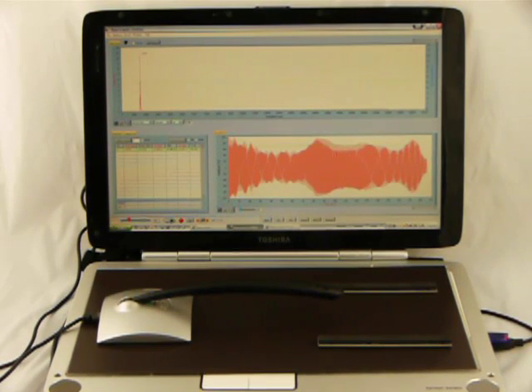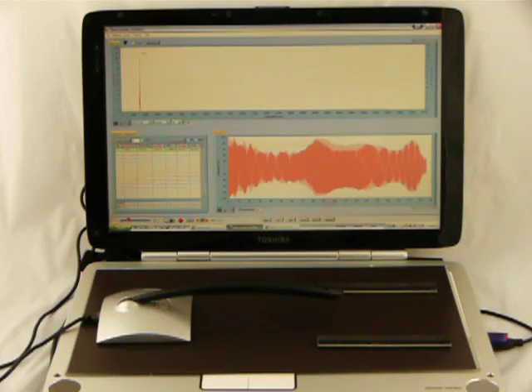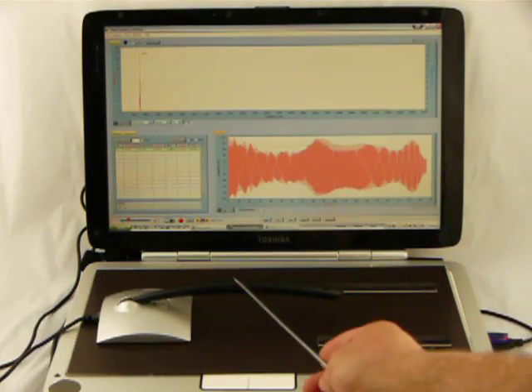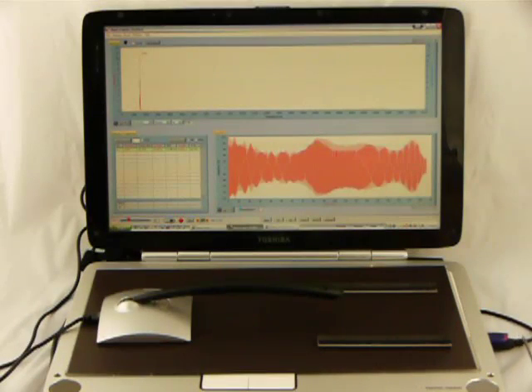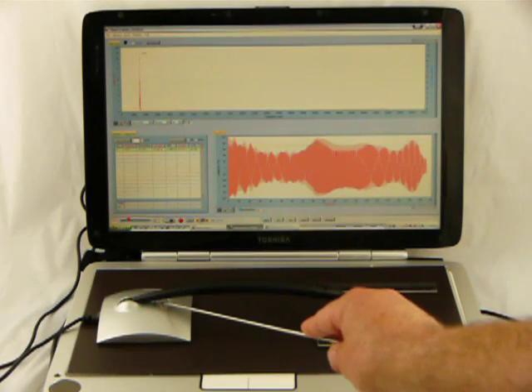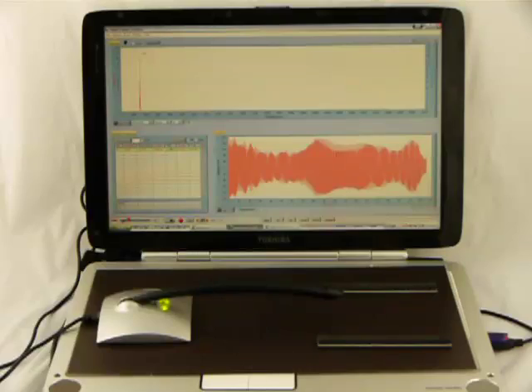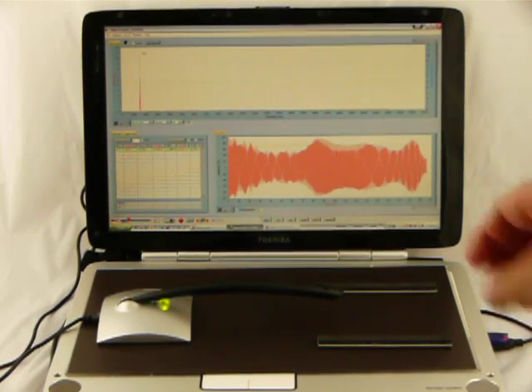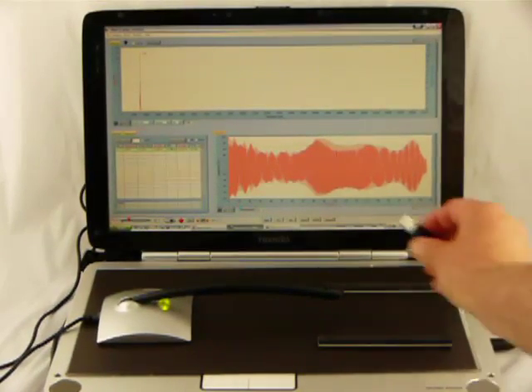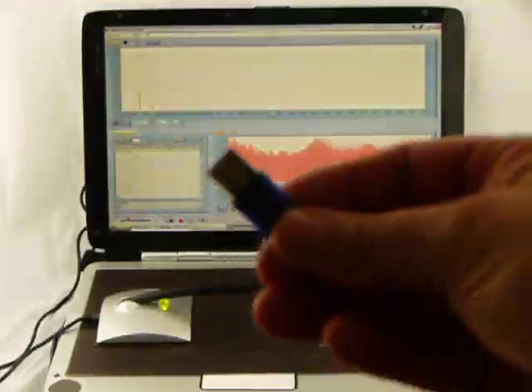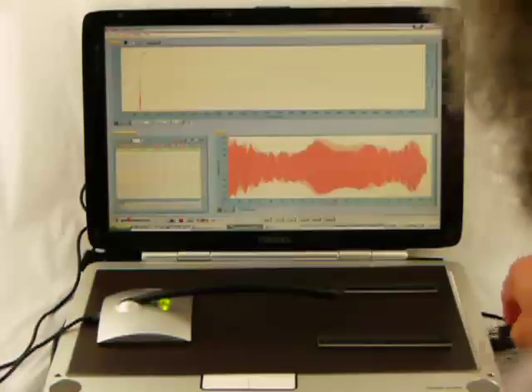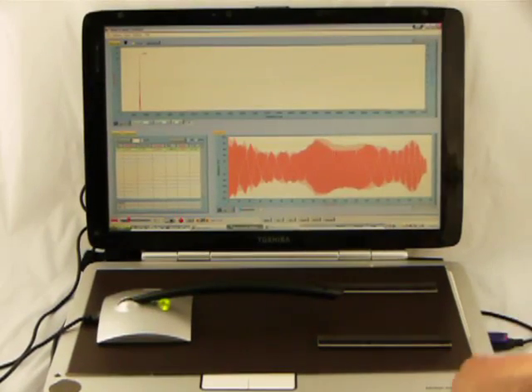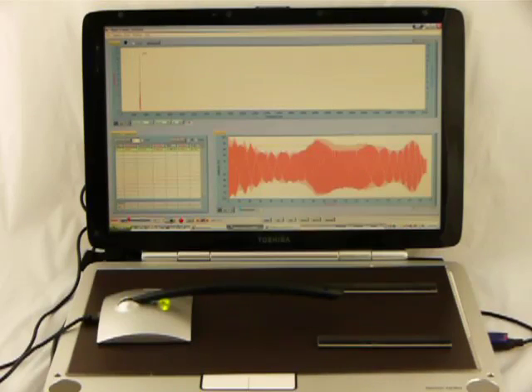Okay, we're all set to take some real measurements now. The first thing you need to do is make sure the microphone is plugged into the USB port. There's the microphone, there's the USB port, and also this button here should be turned on so it should be showing green. The HASP key should also be plugged into a USB port that unlocks BuzzoSonic.